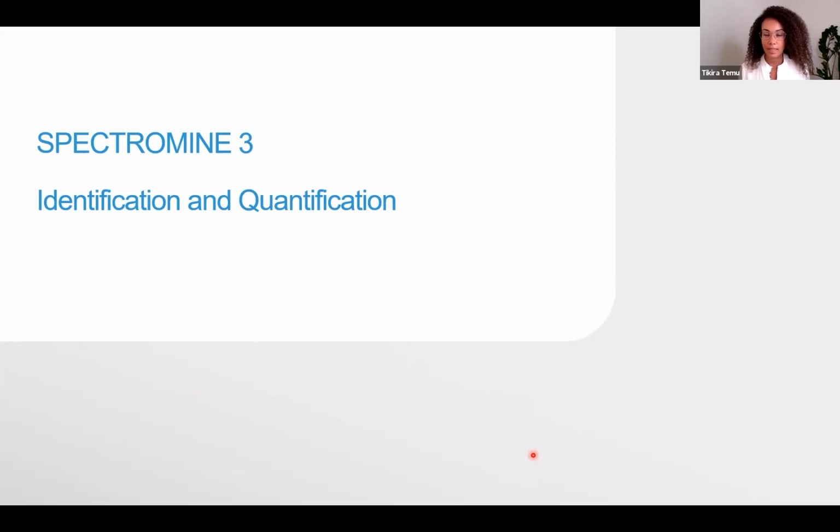Okay, I think we're done, and let's have a look at the outcome. Since most of you haven't heard of SpectroMine so far, it's not surprising that not many of you currently use it to analyze your DDA data, but maybe after the next few slides, I can convince you that it's worth a try.